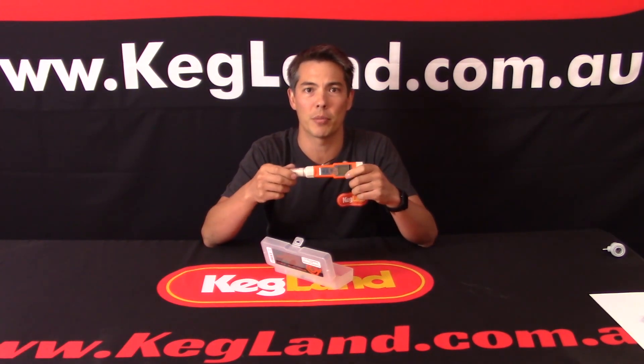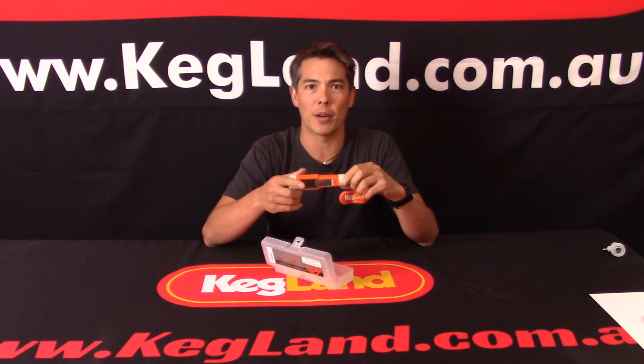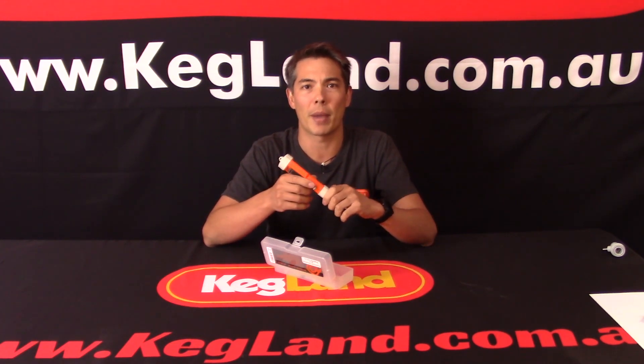Hey guys, it's Key here from Kegland. The main reason we're doing this video is I want to talk through the new pH meters that we've started to make. We didn't really want to start making our own pH meters, but the reality is we went out looking for a decent pH meter and just couldn't find one with all the features necessary for brewers and winemakers that didn't have a really prohibitive price tag. So there was scope for us to come in and make a really good pH meter with all these features but that also didn't break the bank.